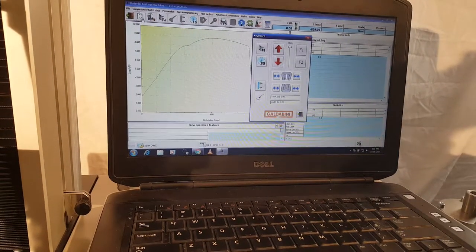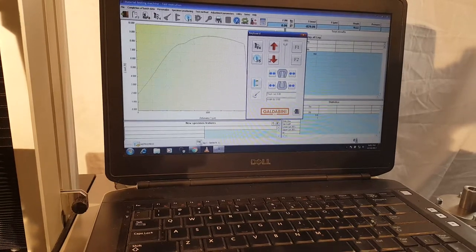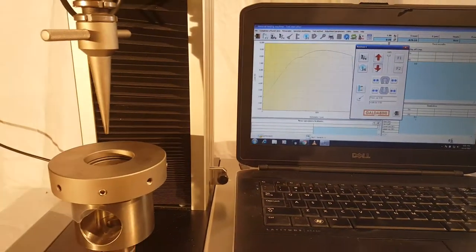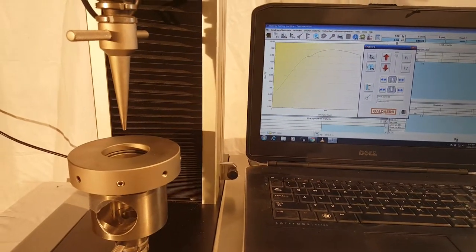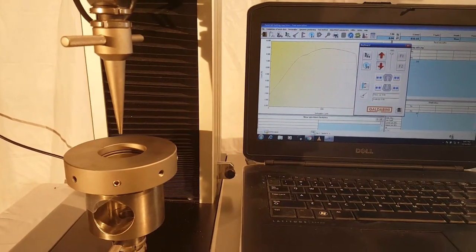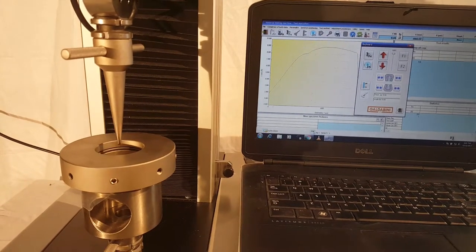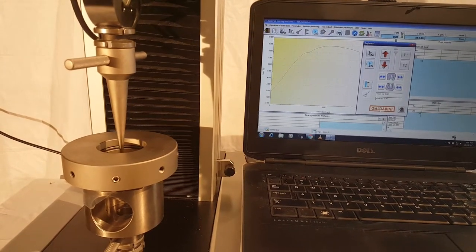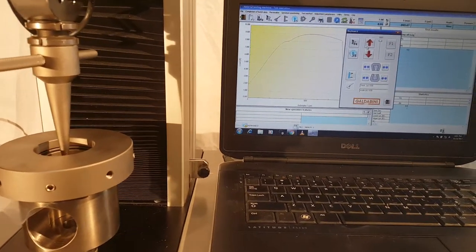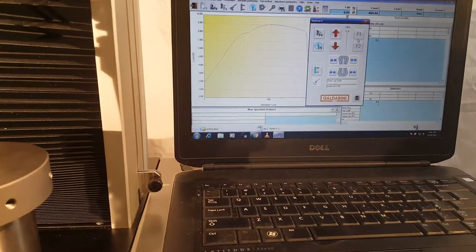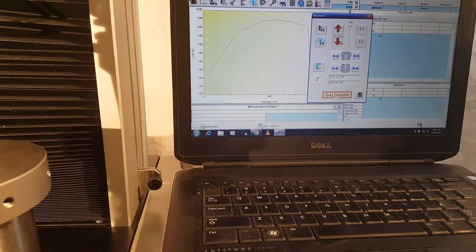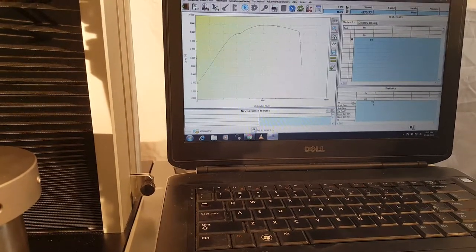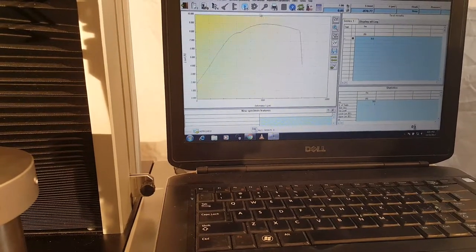First, I'm going to pull up the virtual keyboard here to jog the machine down. Here we go. I'm manually moving the machine down into position. That looks good. A little bit more. Alright.